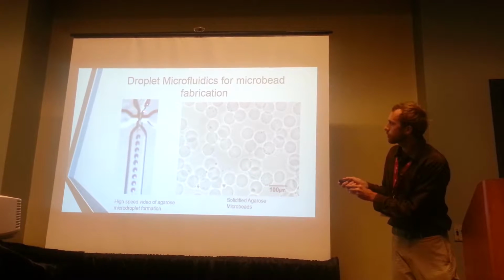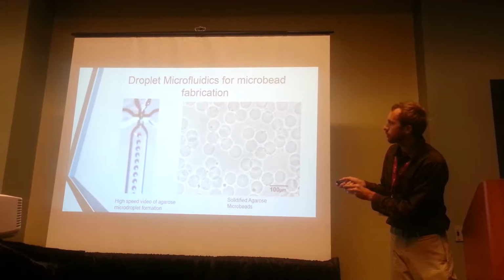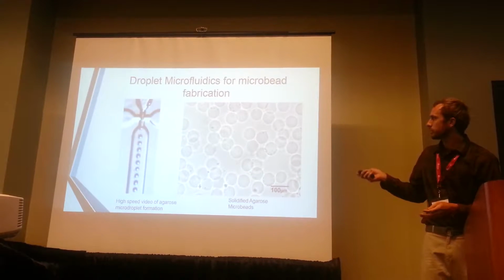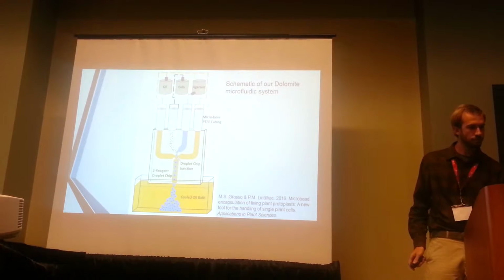So this is a video of this happening. We have agarose coming down here, oil comes in from the left and right, and the stream is broken into small droplets. These drop down into cooled oil and solidify, and we get solidified agarose microbeads.